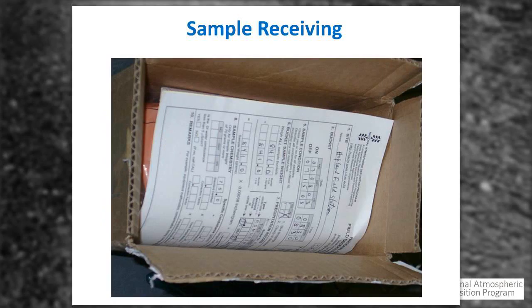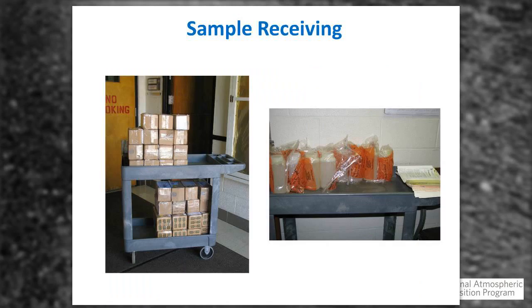Sample is in. It's opened up by one of our chief clerks in back. As they open up the samples, they check out the field form. It's given a sample number. It goes through every section of the field form, making notes, checking out the leakage of the sample. If there's damage to the box that may have caused leakage, lid issue, whatever it may be, that's the first step as it comes to the door, is the opening of the sample box.